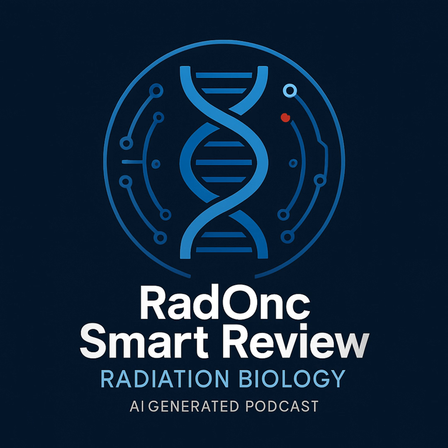Okay, another key technique, especially for specifically visualizing DSBs, is gamma H2AX foci staining. Gamma H2AX. Yes, this is a standard and extremely useful technique. It lets you see the actual sites of DSBs within the cell nucleus. It relies on a rapid cellular response to the break itself. What is that response? When a DSB occurs, specific protein kinases, enzymes like ATM, ATR, and DNA-PK, quickly add a phosphate group to a particular histone protein called H2AX, specifically at serine residue 139.